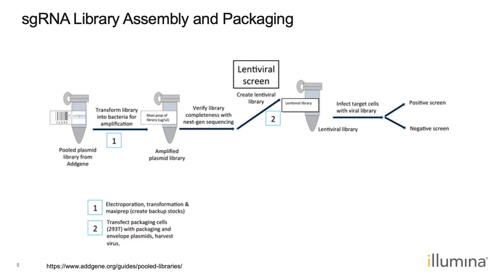Now, if you are going to be designing from scratch, you are going to want to make sure that you have assessed any potential off-target effects of your guides using methods such as in silico tools, to ensure that what you're observing is not going to be confounded by these off-targets. Another thing to keep in mind is that you'll want to have several guides targeting the same gene, A, so that you can help minimize some of those confounding effects of off-targets to help confirm true positives from false positives, and B, to also reduce the impact of potential guide RNA dropouts.